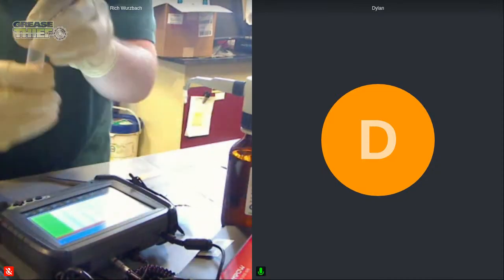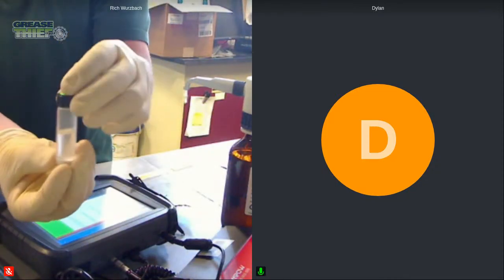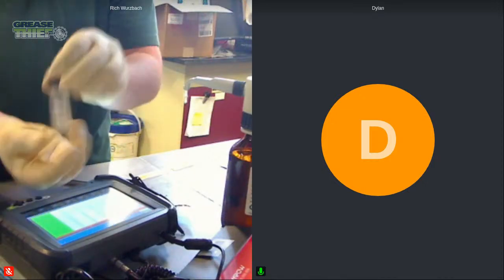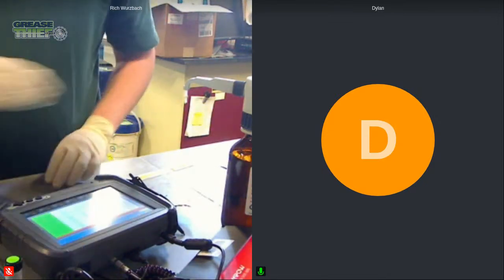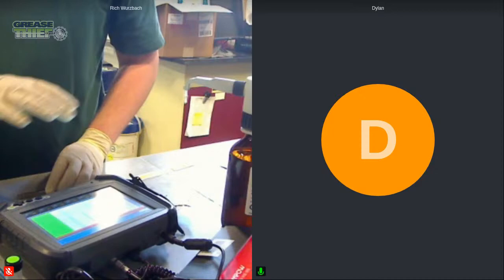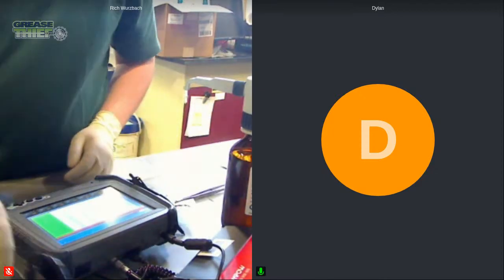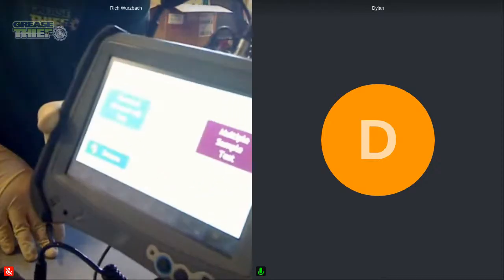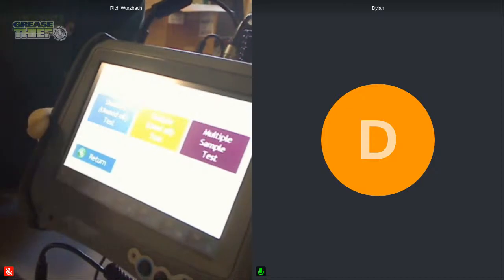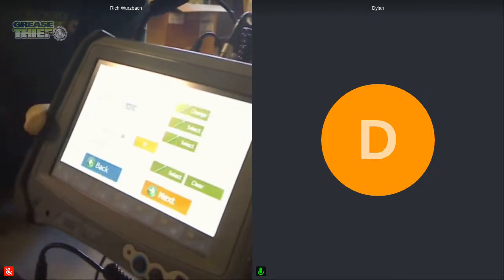And we also have our solution, our vial that has no sample in it. It's just the solution. And we're going to use this to background the ruler so that we know that we're getting a nice background with no peaks in there that don't belong. So we're going to start here. It's going to be a little bit hard to see, maybe. But I'm going to click on Run Analysis, which we can't really see. And then our screen is going to come up there, right there, yep. And I'm going to click on Sample, Used Sample Test.